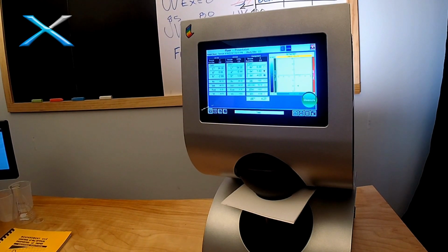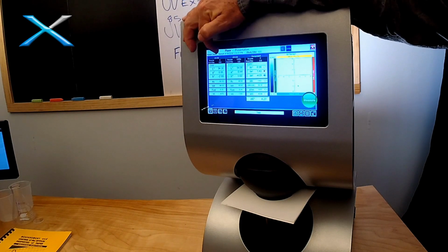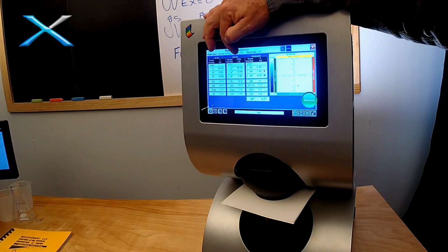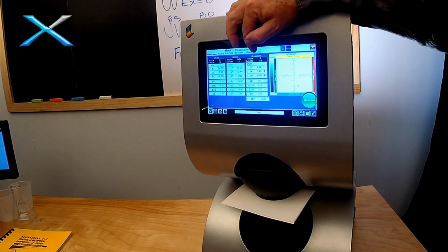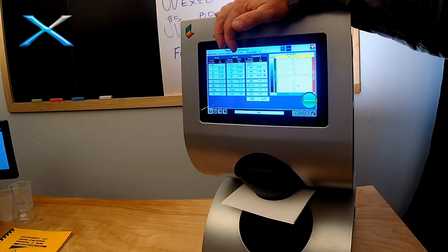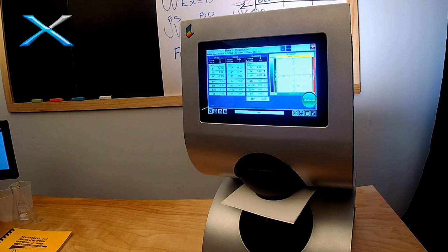Now this presentation also does color. We're not going to look at that right now. We'll focus just on brightness. So brightness under UV included is 90.19. Next column is UV excluded, and it's 84.32. The third column is the component value. So the delta brightness is 5.87, or roughly 6. So the fluorescence boost we're getting to our brightness is 6 points.